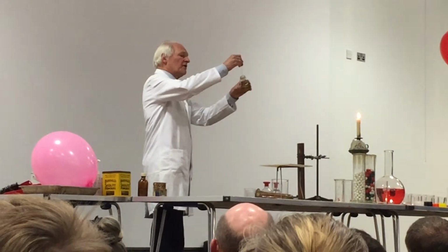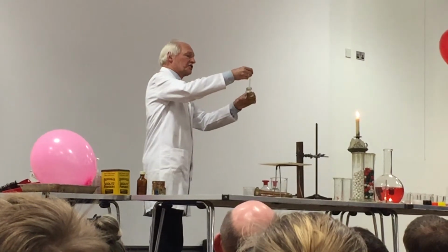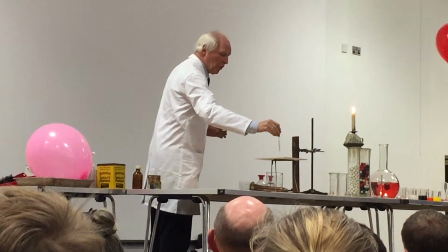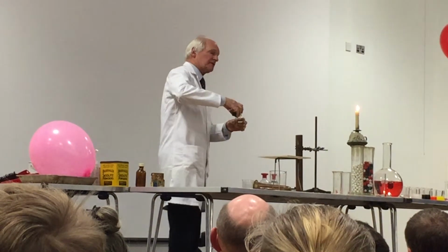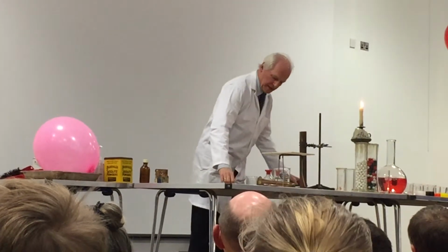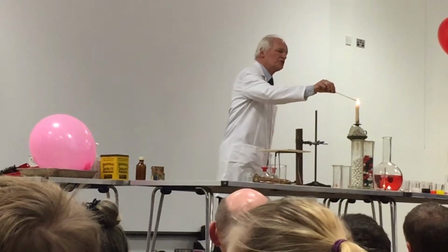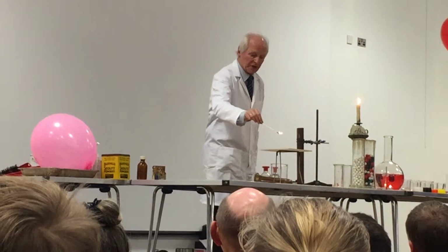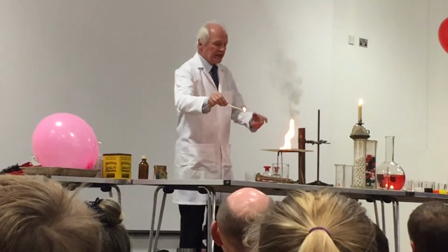I'm going to start off by burning some petrol on an open mat, which I have here, and there it is, a teat pipette full of petrol. I'm going to pour it on there, and then I'm going to replace my top here. Petrol is very flammable indeed. And I'm going to then set it on fire and ask you to ask yourselves the question, do you think that this is the way that petrol burns inside a motor car engine? And there it is. Now, please watch carefully.